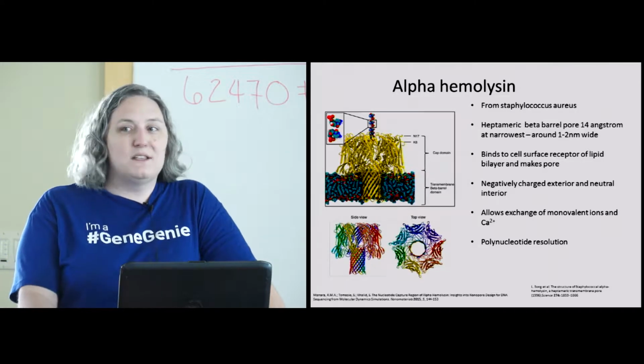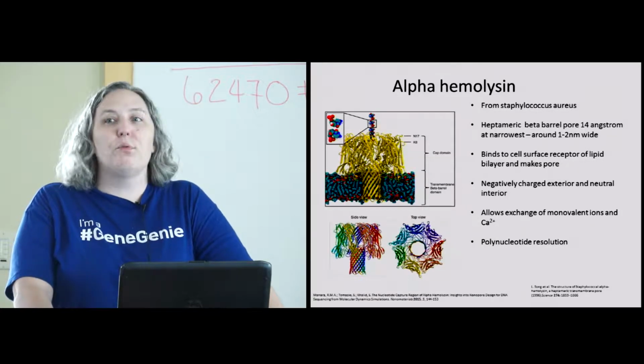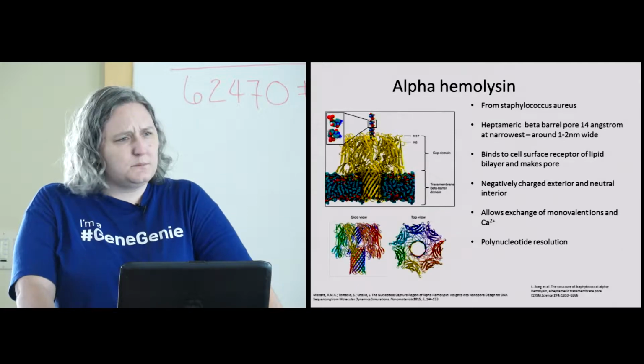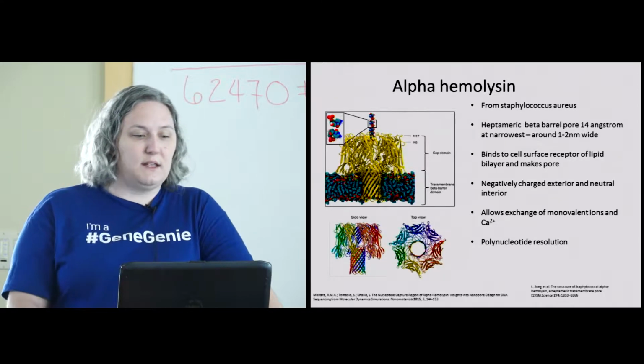There's been a fair amount of research on this particular protein, at passing proteins, DNAs, other oligomeric material through it. That's because this pore is capable of remaining open for very, very long periods of time and accommodating relatively large molecules through its pore.